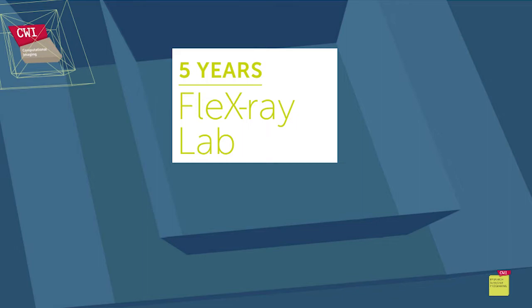A bit more about recent developments, also some applications. They're intermixed a little bit in the presentation that we have at our facility. So unlike previous speakers, we're not a user of the FleXRay Lab. I don't have any experience with the FleXRay Lab, but I assume that there are some parallels between our systems and the FleXRay Lab system, for reasons I will show during the presentation.